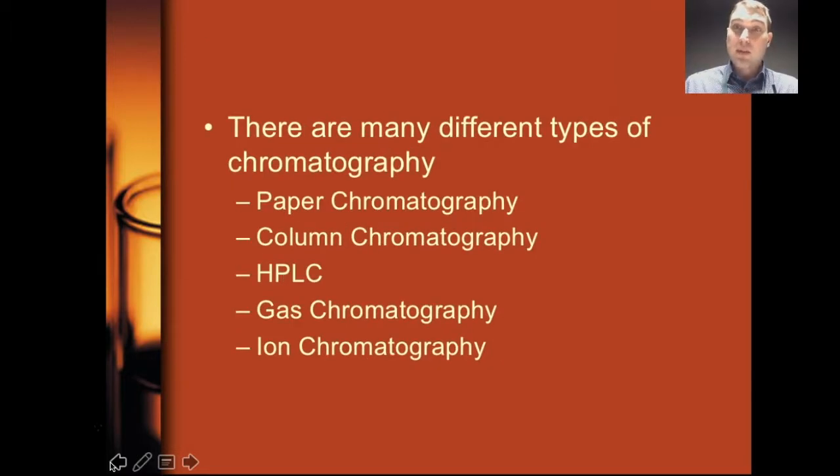So there's many different types of chromatography. We've got paper, which is also thin layer chromatography, column chromatography, HPLC, so high performance liquid chromatography, gas chromatography, and ion chromatography. I'm going to go into detail on ion chromatography in a separate video, so keep a lookout for that.